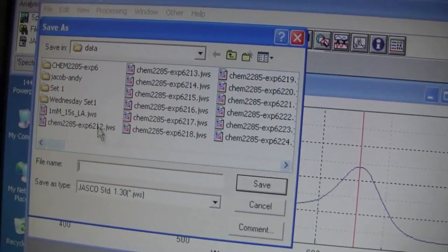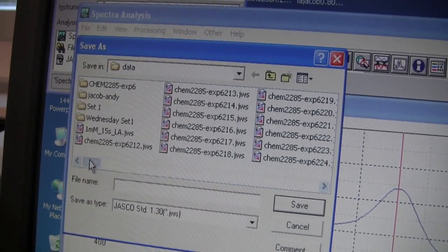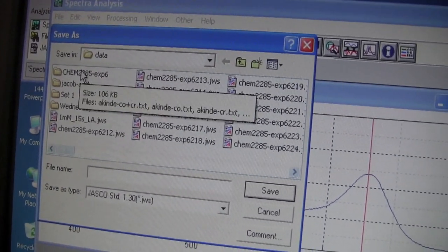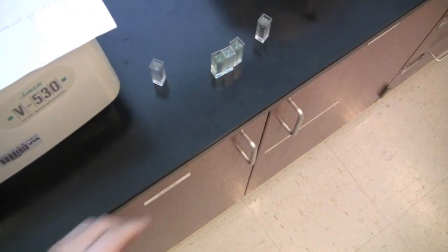Save this file using your initials and the solution concentration. Use a folder set up by your lab tech. Remove this cuvette and repeat using the same procedure for the rest of the cuvettes.